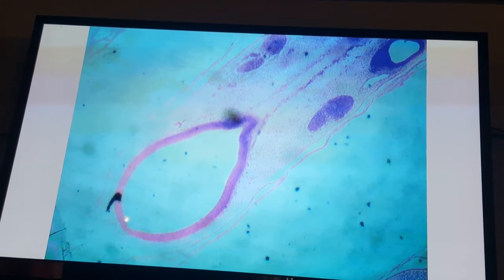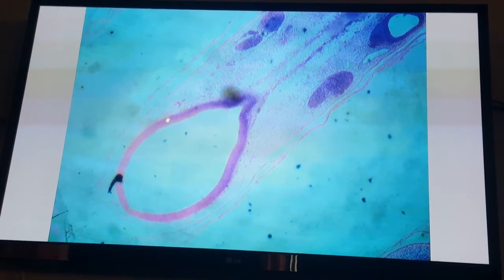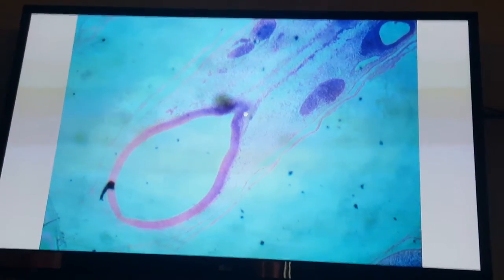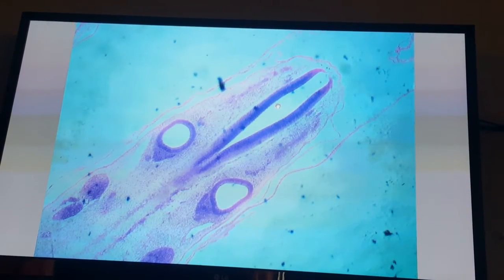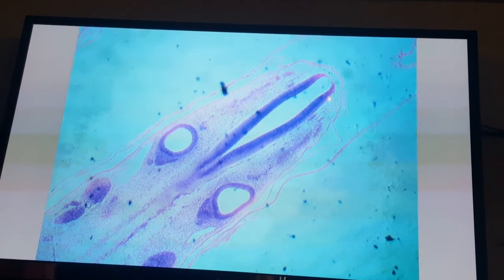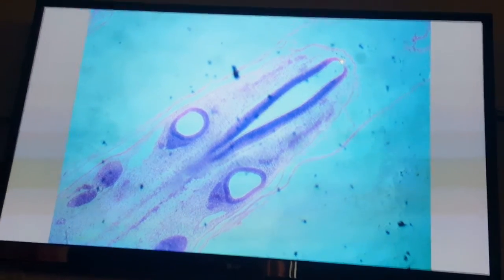For example, this is one side of the U, the limbs of the U, which is the diencephalon. And I can discriminate that this is a diencephalon because this is the infundibulum of diencephalon. On the other side of the U, the other limb of the U is shown, which here is a myelencephalon. And I can diagnose that this is a myelencephalon because its roof is not formed by a neuroepithelium, it's formed by a thin membrane that will form the choroid.